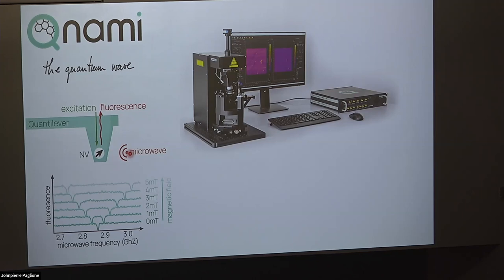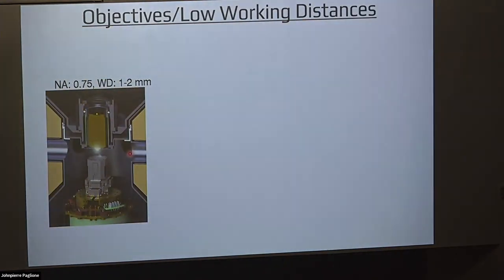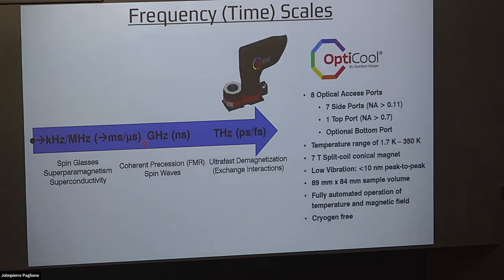So again, the cryo cooler, you look at the manual, it's basically on this hexapod anti-vibration system. Basically what they tried to work on to get the vibrations down is, conservation of energy. They have to go somewhere, and they're trying to do their best. I guess I don't have a complete picture of the optical. But basically, this here is suspended and there's a rod that goes to the floor. So the idea is we try to shunt as many of the vibrations this way down to the floor, than this way to the sample. That's also part of the secret sauce on vibration control in here.